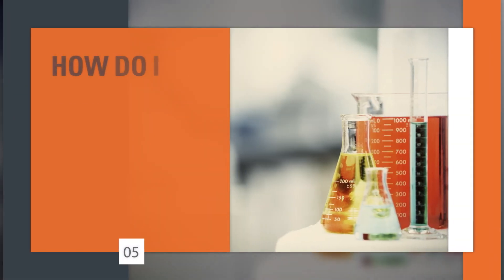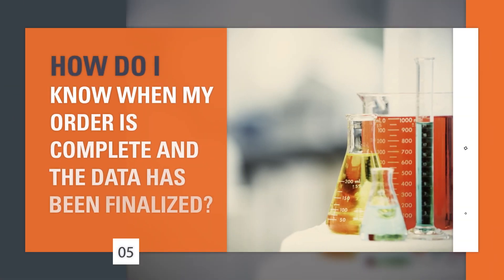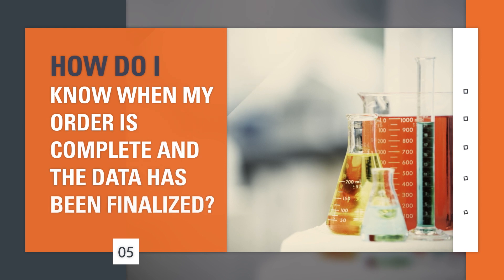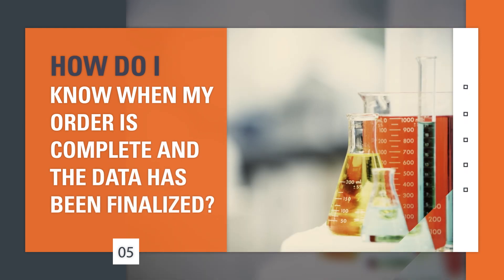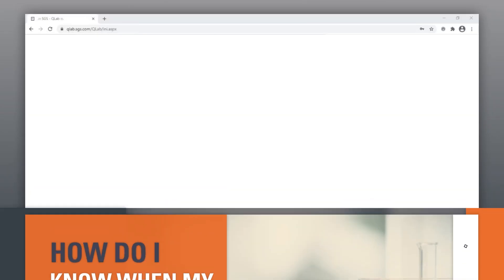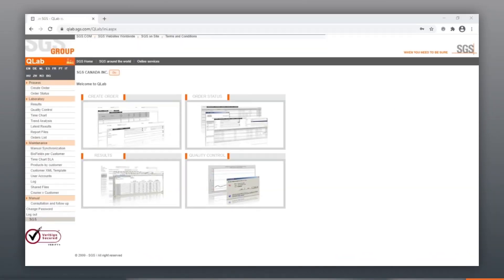How do I know when my order is complete and the data has been finalized? To track the history of an order, click on History Status by Order. This allows you to see how your order has progressed from one status to the next over time.